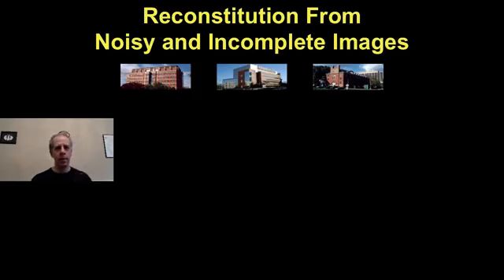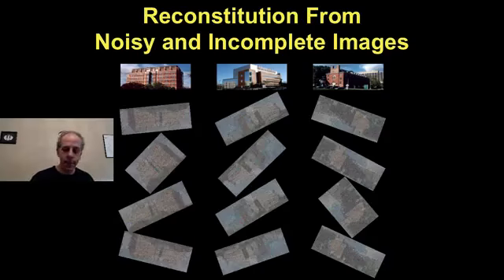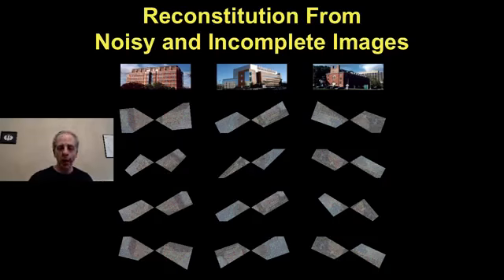So here is the problem. Let me illustrate that to you. Let's say that we have 3 scenes, as we see here: 1, 2, 3. Now let's simulate cryo-electron tomography for this. We basically get multiple copies of each one. That's a good part. Very noisy. Okay? That's not so good. The multiple copies is good, the noise is not very good, but we have to deal with that. We get them rotated. That's also not very good, but we're going to have to deal with that. And then we get the missing wedge.